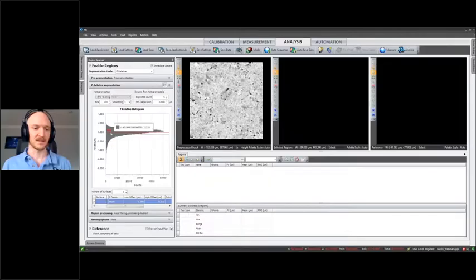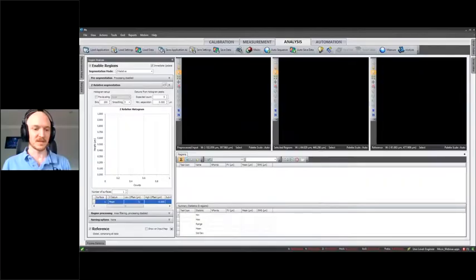And then, because the majority of our data lies within plus or minus 2 microns, I'm going to choose a threshold for our region detection. I'll start at about -3 microns from the mean, and then we'll capture everything from this point down. So in my high offset, I'll select -3. And then in my low offset, I'll choose something large just to make sure we capture everything, like -15.